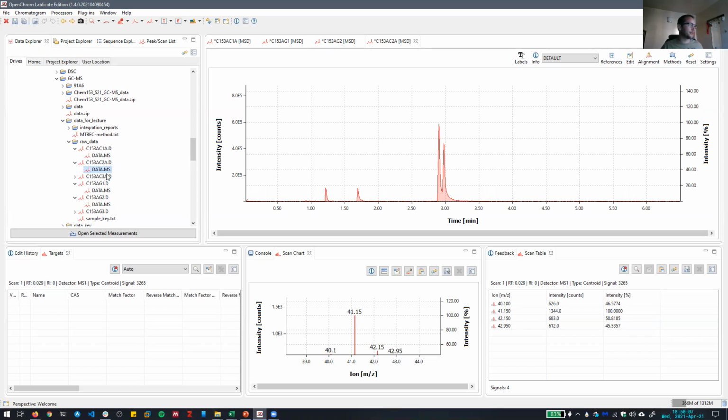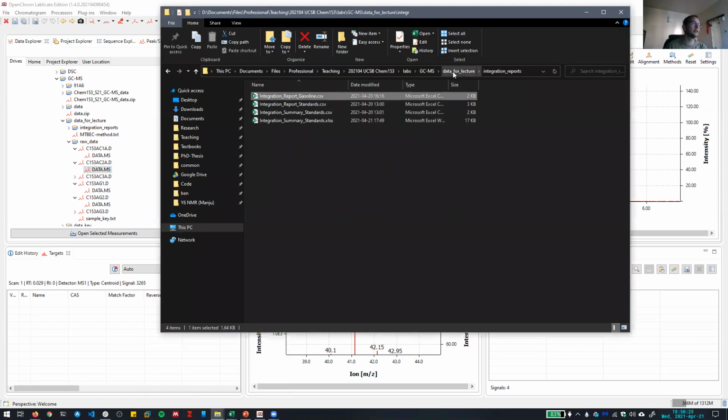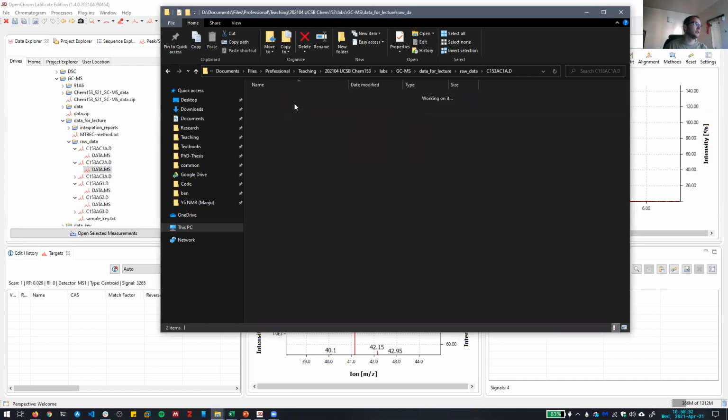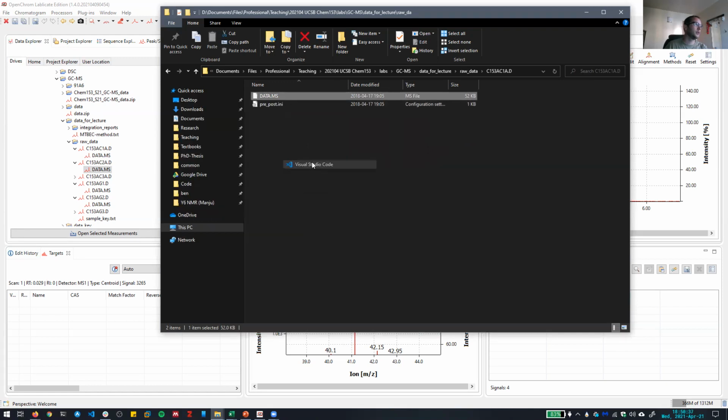Yeah, these files contain a bunch of the information, so all of the chromatography data as well as the counts for each scan. I was trying to find a way to open these some other way, but basically it's a proprietary software format. If you open it up as a text file, it's just basically a bunch of garbage.